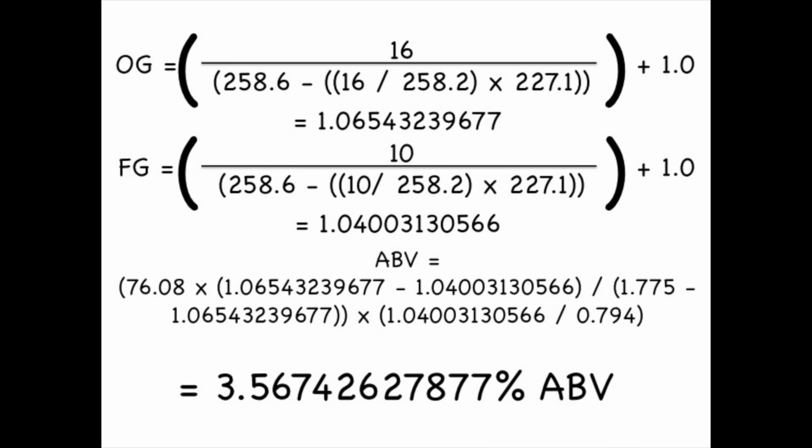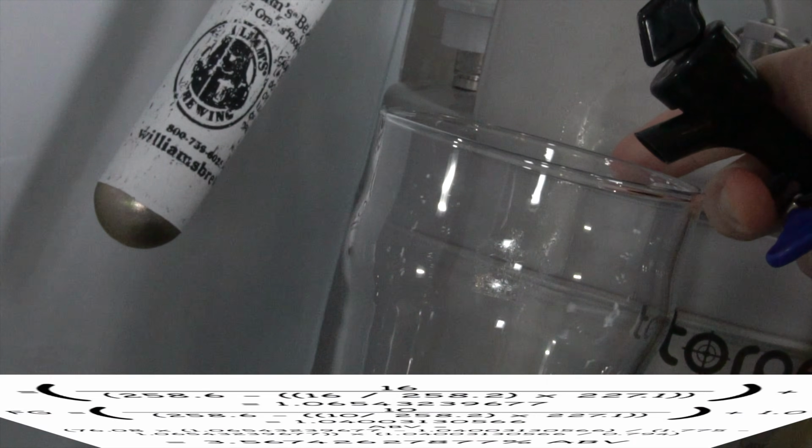Well, there you have it. I wanted to keep this video short and to the point. I'll put the equations as well as the links to the equipment in the video description.